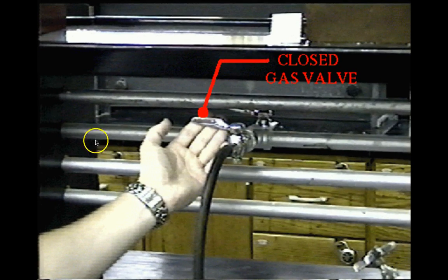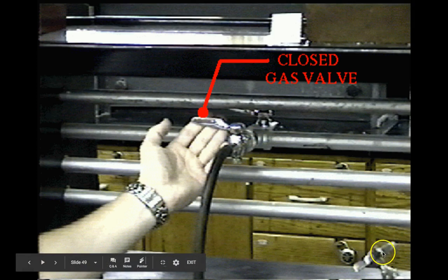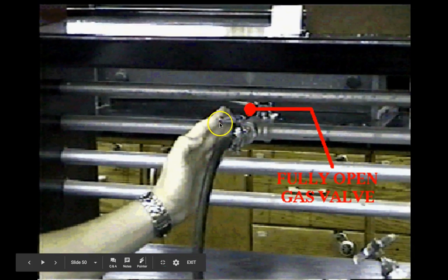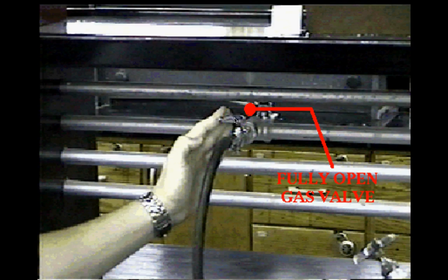If you look over by the sinks, you'll see water faucets and gas valves that look similar. A water faucet turns on normally; the gas valve works just like it but controls gas. Right now it's in the closed, off position. If you turn it so the handle points straight out, it's on — and you always want it fully on. Never control the amount of gas with this valve; if your flame is too high, adjust it from the Bunsen burner itself.